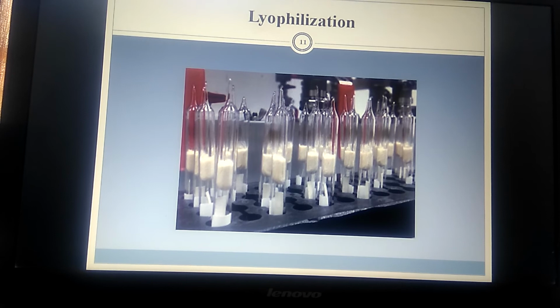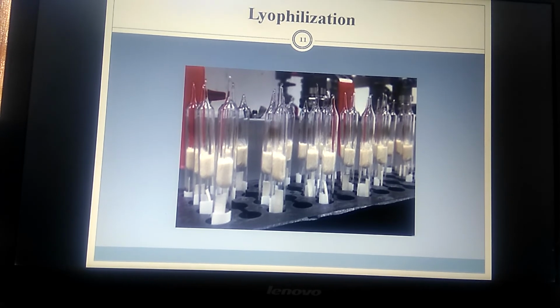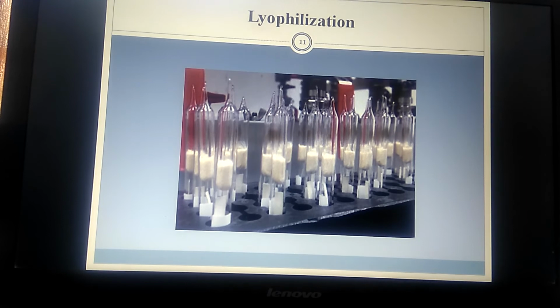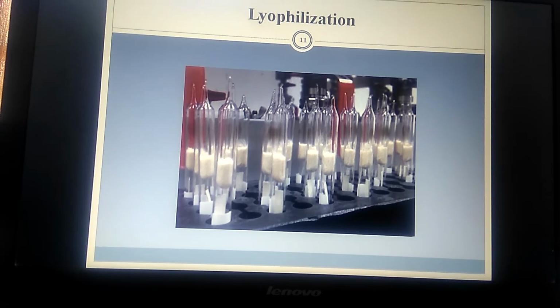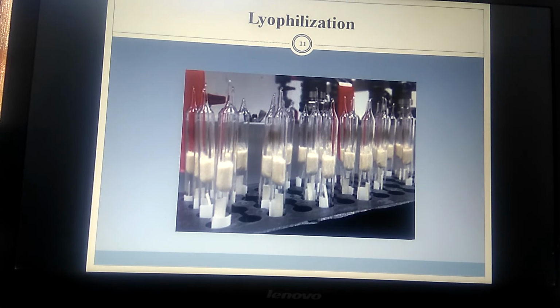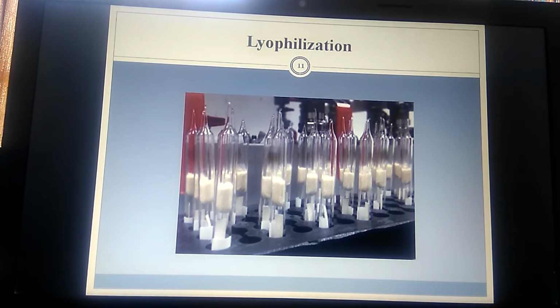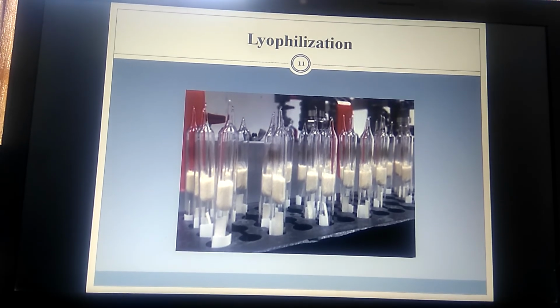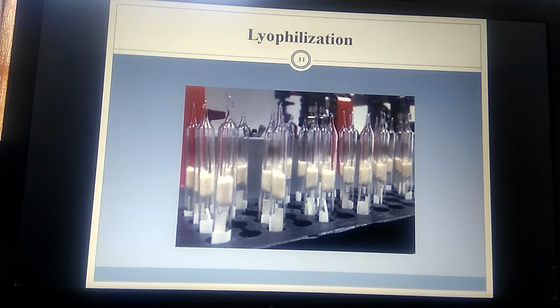Here we use something called the sublimation process. You know what sublimation is? Conversion of solid directly into the gas condition. That is, ice will be directly converted into gas. That is the reason why it is called freeze drying. This will be used in production laboratories, drug production, etc., to preserve the drugs and vaccines, and it is often done for transportation of the organisms. So these are a few techniques where we can preserve the organisms for really long times.